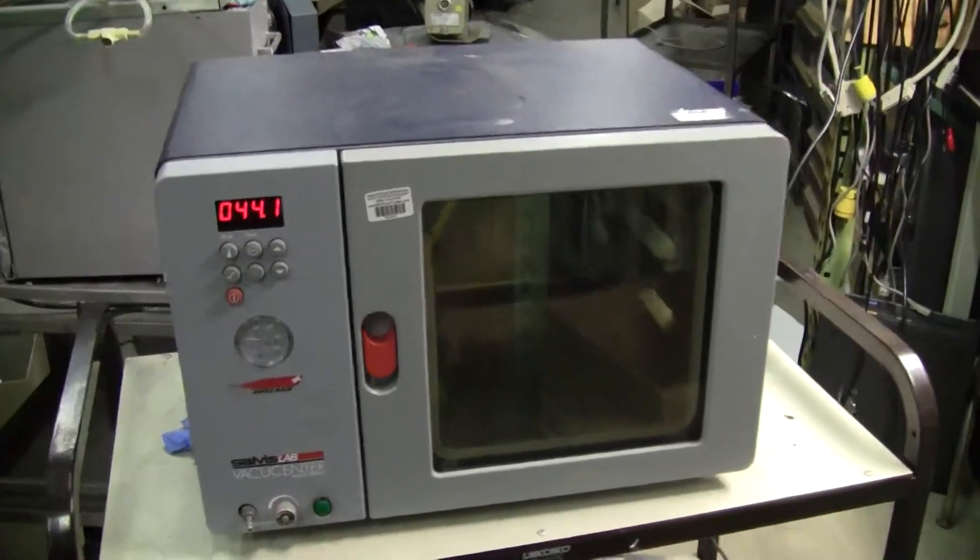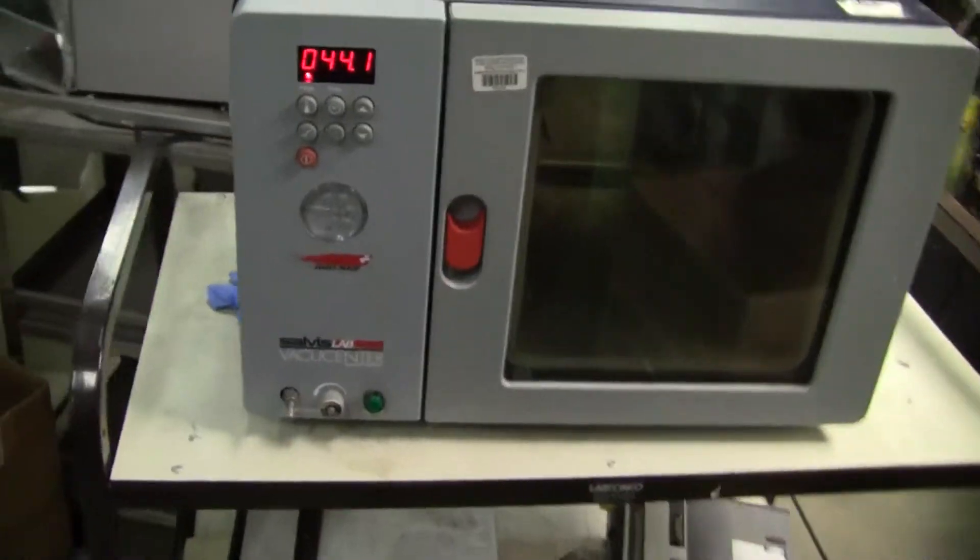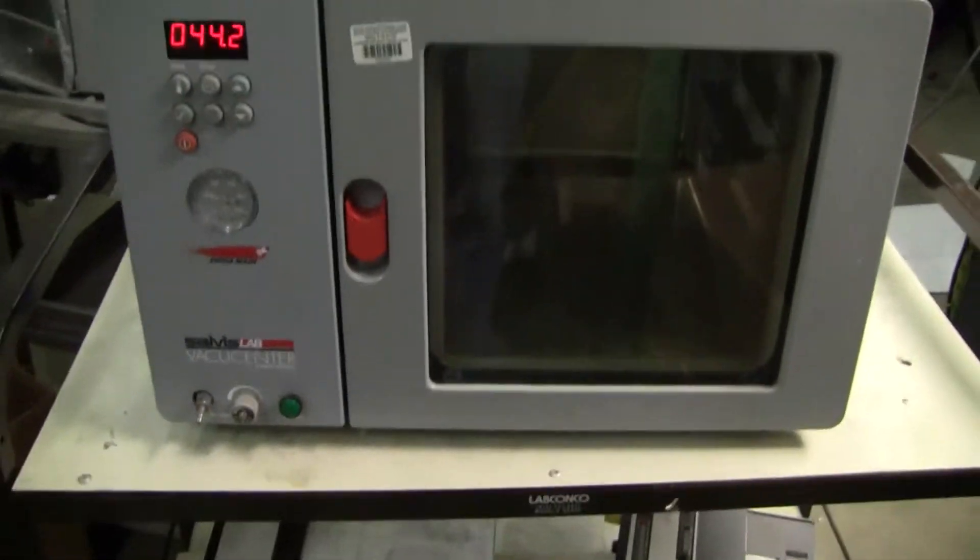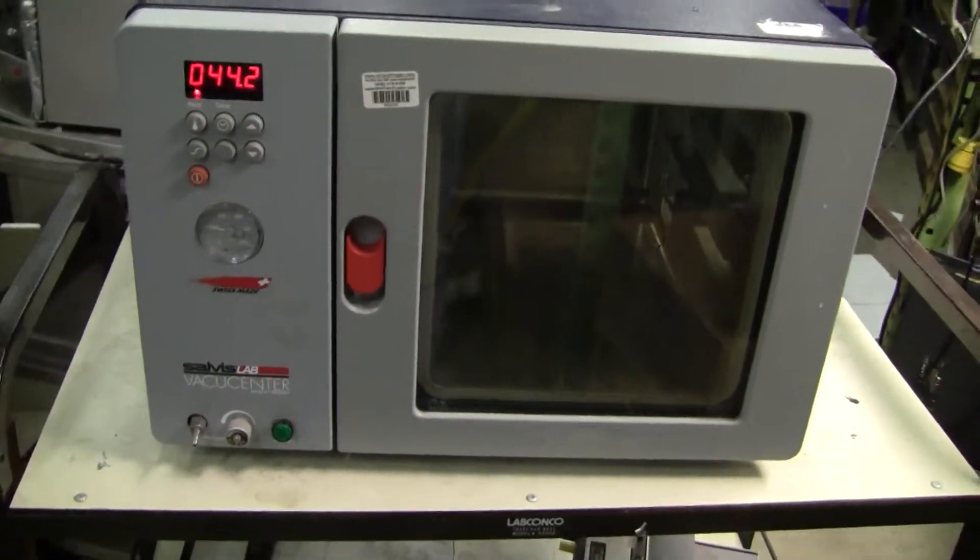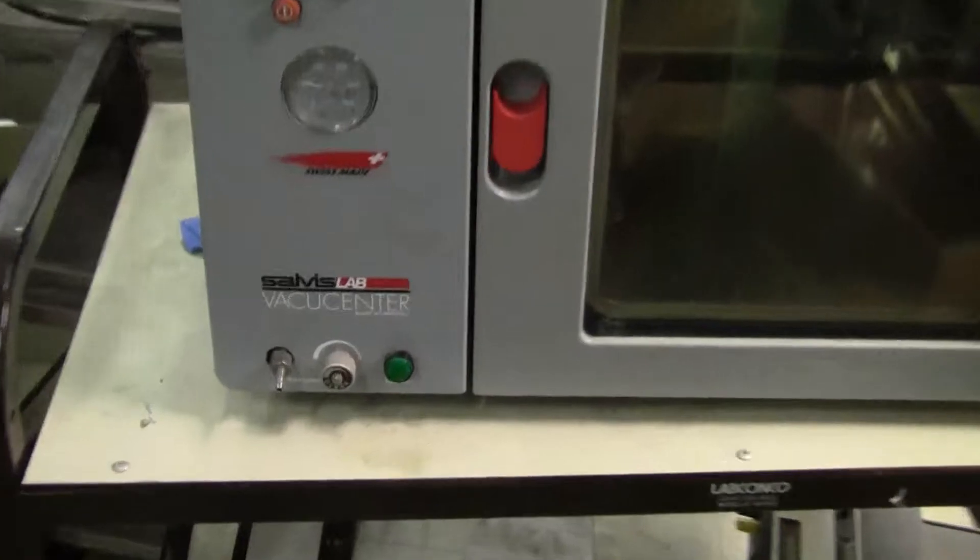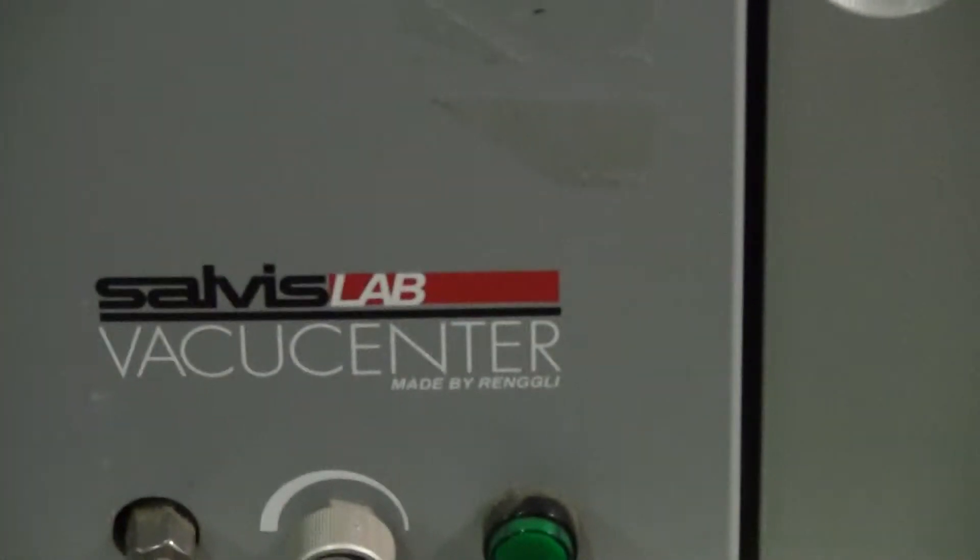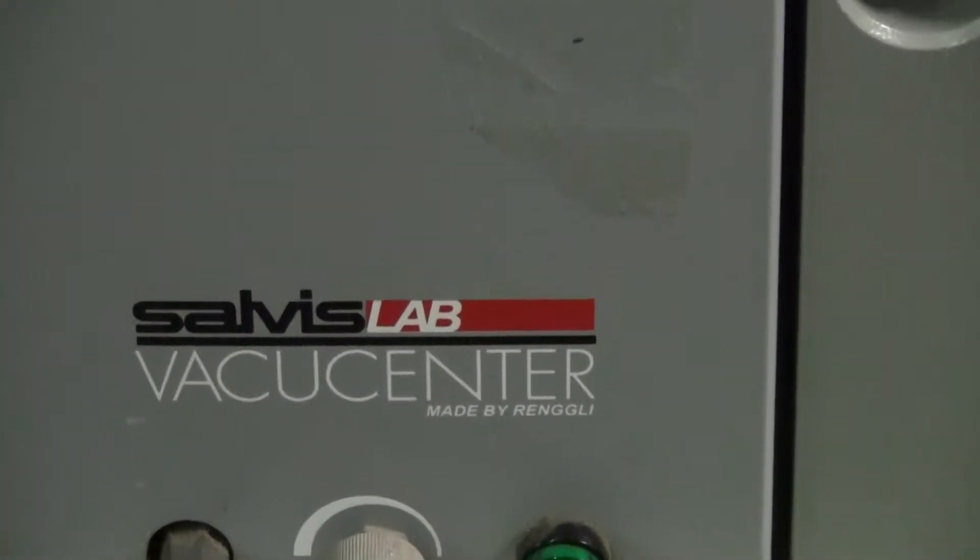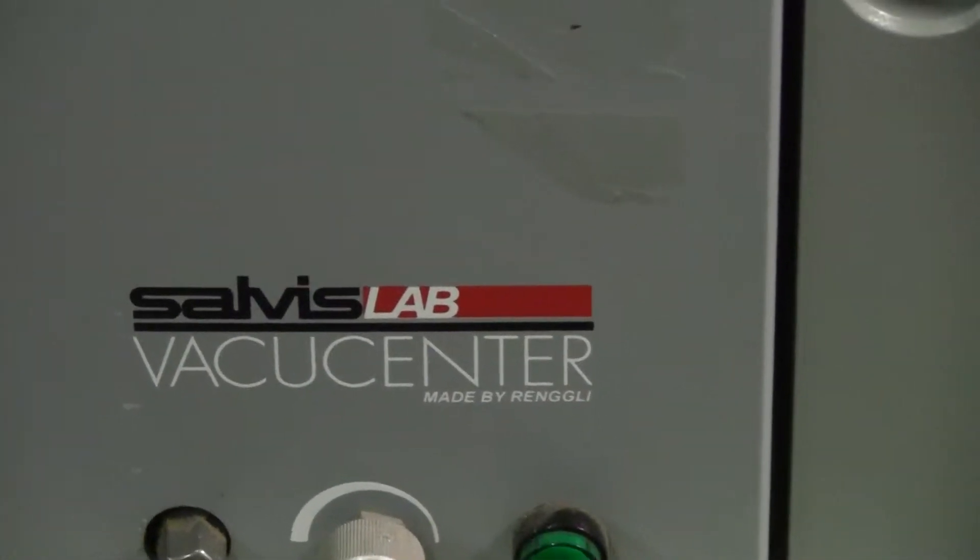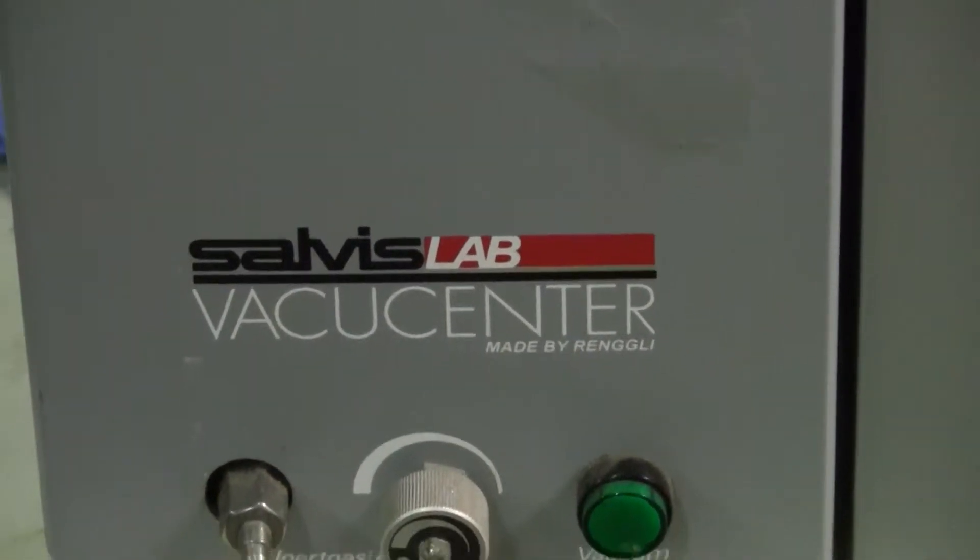Hi, this is Michael from HitechTrader. Today we're looking at a vacuum oven made by Salvis.